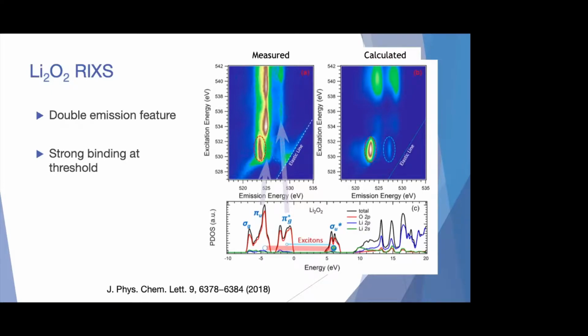So the low energy, certainly the elastic line, and possibly the tailing you see at low energy in the measurement here, are both, well, certainly the elastic line is due to vibrational coupling. And so the idea is, the vibrational modes of O2 should look different than the vibrational modes of O2 minus. Or not, the modes look the same, but the energies will be different as you oxidize the oxygens.